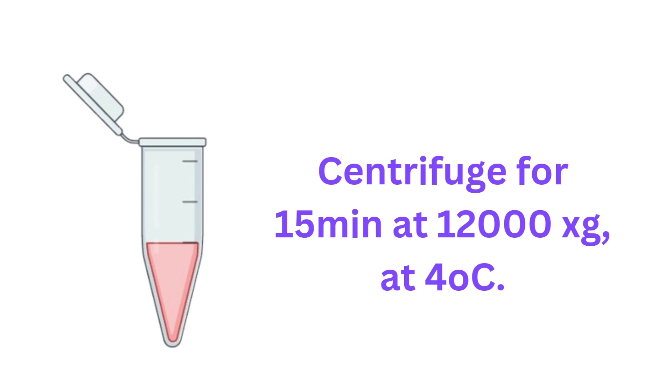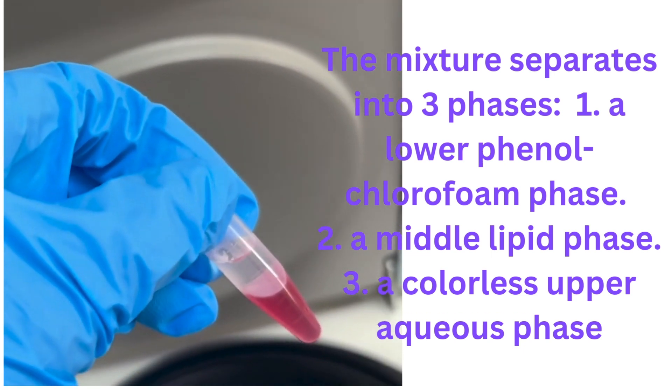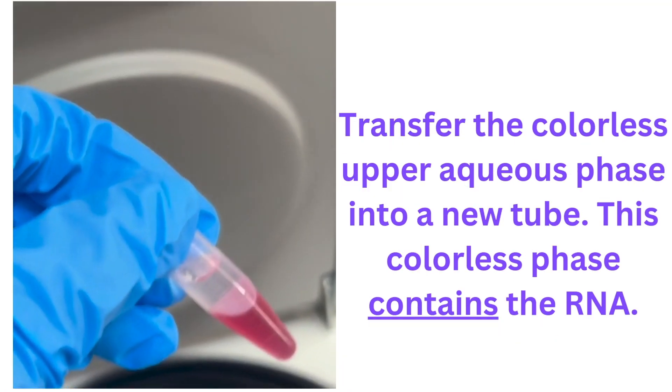After waiting two to three minutes, centrifuge at a fairly high speed: 12,000 × g for 15 minutes at 4°C. We keep the RNA protected by doing it at a cooler temperature, since previously everything was done at room temperature. You'll now have a sample separated into three distinct phases: the lower phase is the phenol-chloroform phase, the middle phase contains lipids, proteins, and DNA, and the top layer is a colorless aqueous layer that contains the RNA.